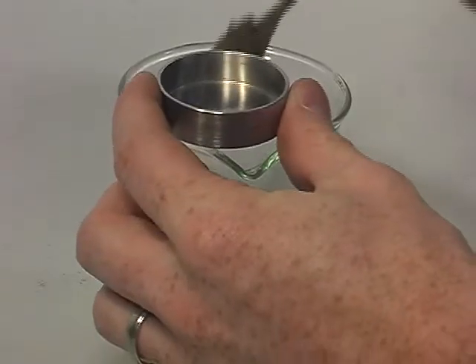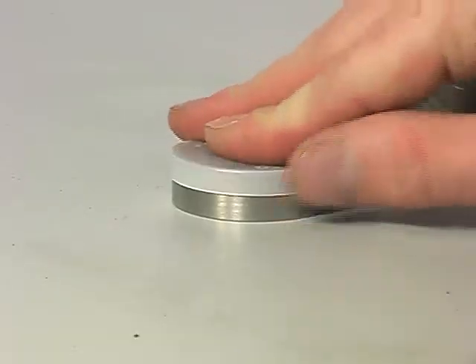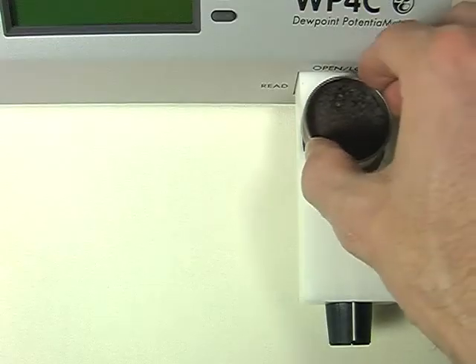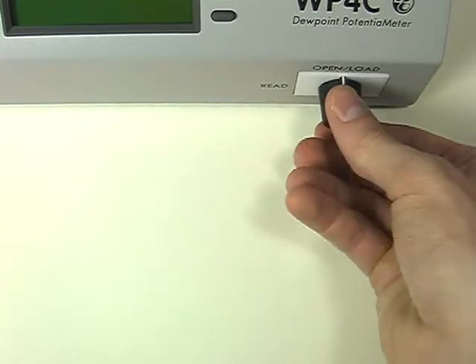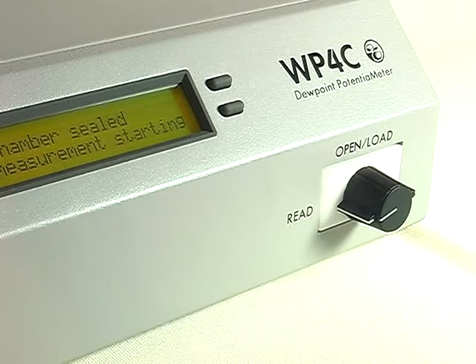The WP4C comes with 10 stainless steel and 25 disposable sample cups. To measure water potential, fill a sample cup not more than half full. You might want to cap the cup and let it equilibrate. Remove the lid and set the cup in the sample drawer. Close the drawer and seal the chamber by turning the knob.